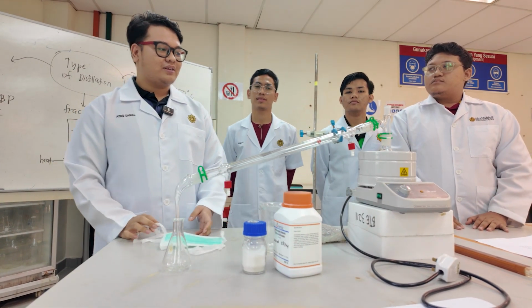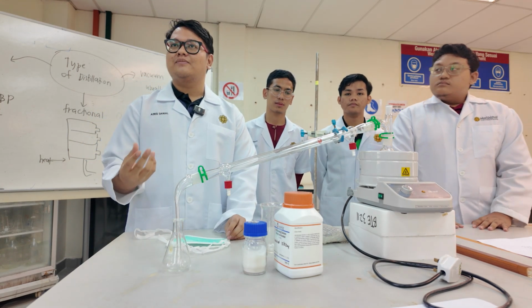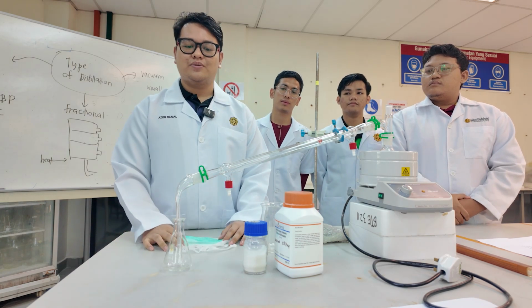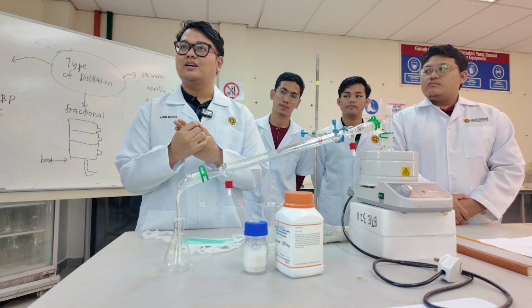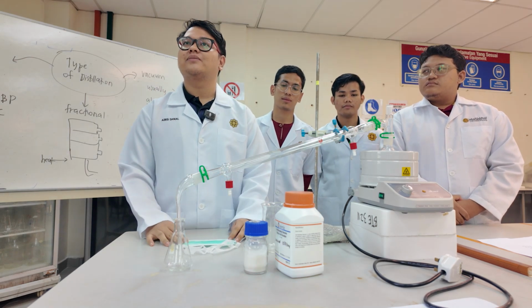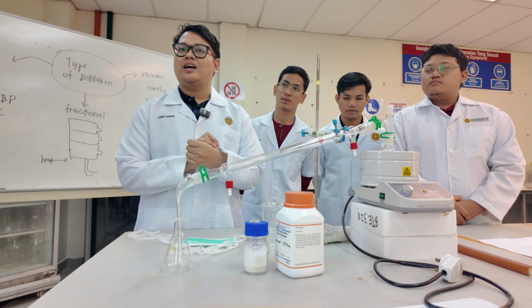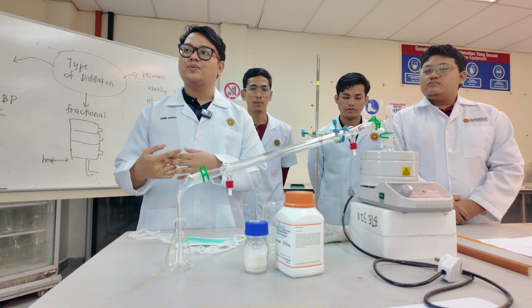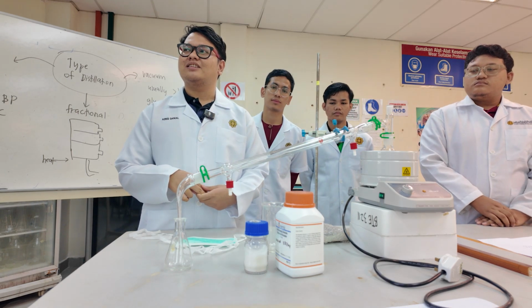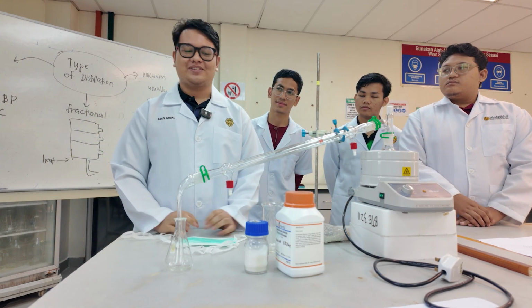And also, when dealing with solutions that are volatile or corrosive, we need to wear gloves, and also wear goggles to prevent the substance from touching our hands or eyes. And also in industry, we need to wear full PPE, which is personal protective equipment. Okay.